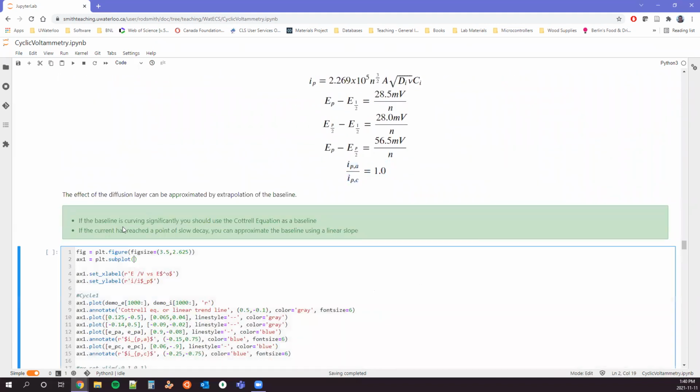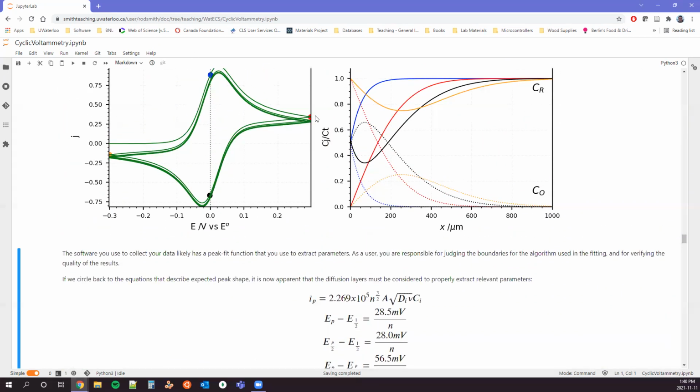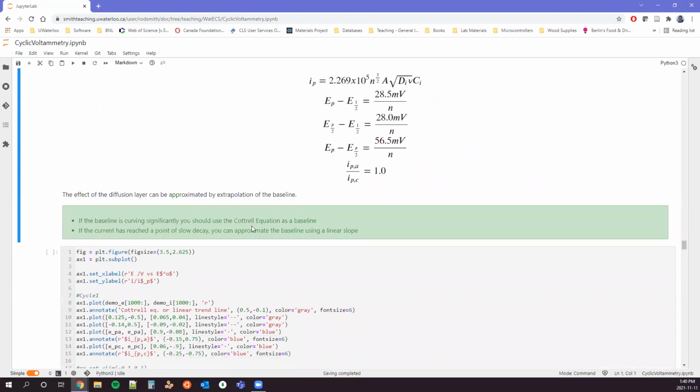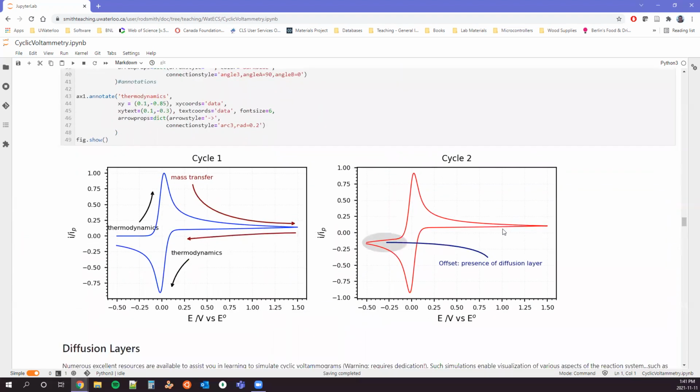Right? And so there's two ways to do this, because in this situation it's based on the Cottrell equation. Here, we can extrapolate using the Cottrell equation, right? And so we can take the one over the root of time and fit that curve. If you have a steep, continually curving baseline, that would be the appropriate way to do it. If you're more in a situation like this, where you've scanned to a large overpotential and this is almost a flat line, you can just approximate it with a linear slope.